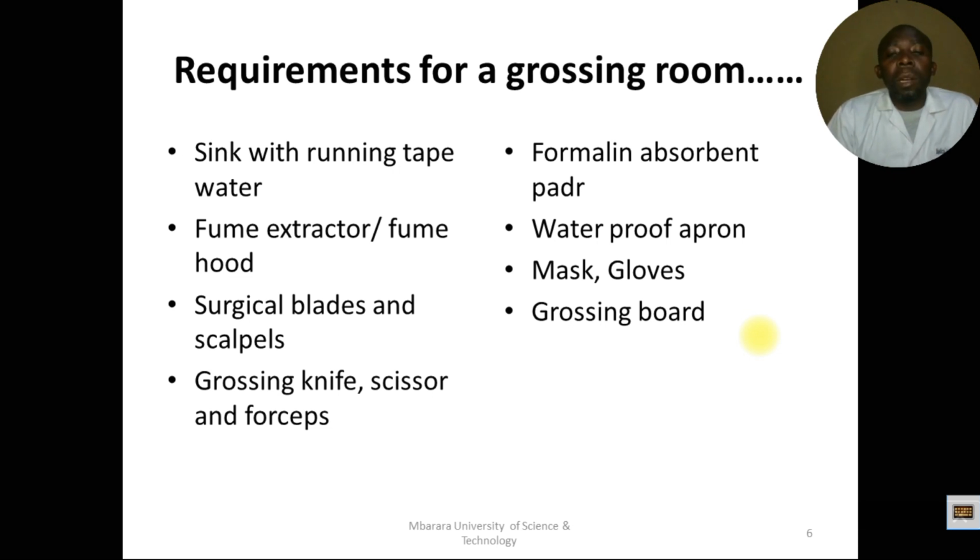You remember we are handling samples which have been fixed in formalin, and there are actually formalin fumes getting out of the samples we are handling. So we need the fume extractor to reduce our exposure to formalin.